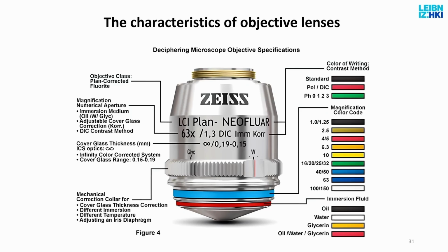And that's because, to put it simply, there's an extra lens inside the microscope, the so-called tube lens, which will make the light beam parallel inside the microscope. And I did mention this at the beginning, that light beams in a microscope are always parallel. And that's because of the tube lens. And without details, the point is that if you have a parallel light beam and you want to focus it, the lens with which you focus can be anywhere along the light path, because the light path is parallel.